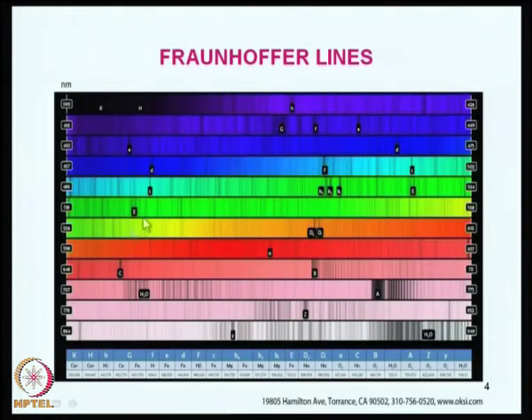This is actually a detailed diagram of the same, where you can see the elements determined using these dark lines. You can see dark lines all over this.